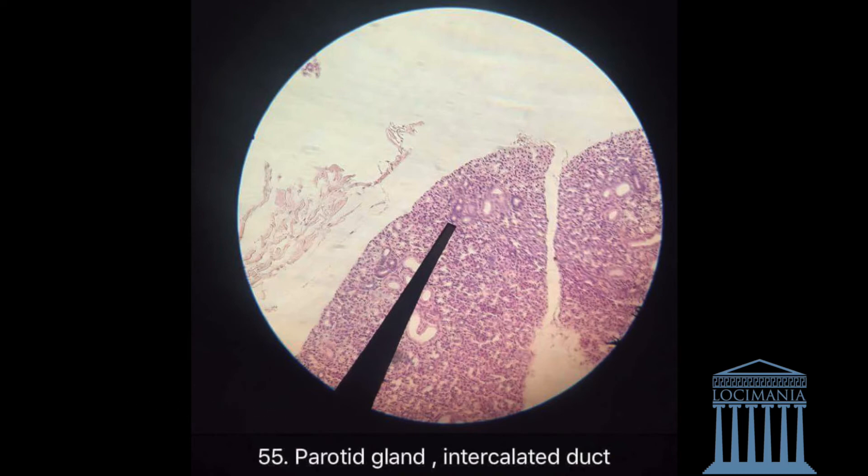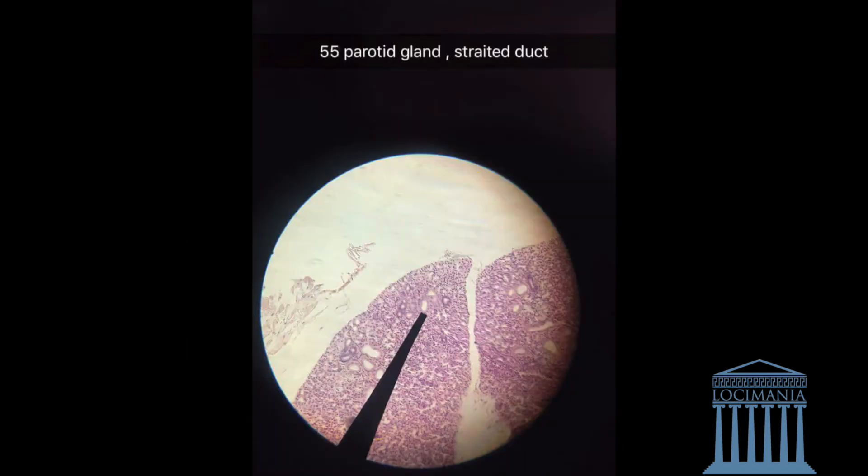If we go to the striated duct, however, they are lighter. They are lighter but they are also bigger. They look like the intercalated duct but they are lighter and bigger.